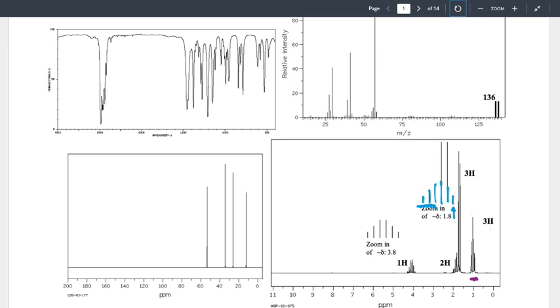That's not within 3 bonds, which means not a neighbor. Kinda, sorta? Okay, so what does that mean for us when we start to move into our interpretations? The easiest one to look at is going to be this one right here. So we'll look at orange. My first interpretation, I want to copy the past stuff. So I've got a CH3.